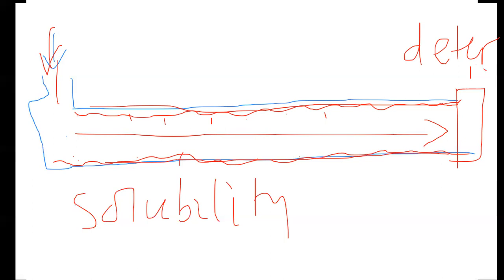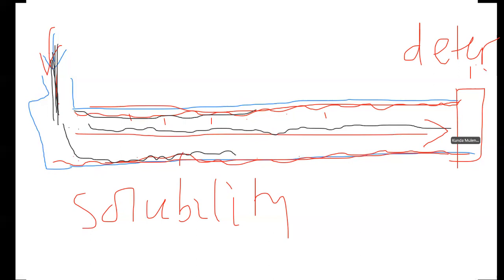So the moment this sample comes in here in form of a vapor, because remember, even if you introduce this in terms of a liquid, because of some temperature around, it's going to be turned into a vapor. So some of those components will be interacting with the walls. They'll be dissolving in the solvent along here. While me, who is just minding his own business, I'll just move all the way up to the time I get to meet the detector, and then the detector picks up to say there's a component which has come.